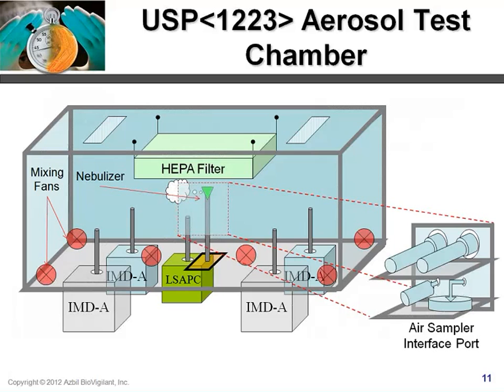So it was validated to achieve ISO 4 particulate levels, which is extremely low. Most clean rooms in the pharmaceutical and life science industries are ISO 5. So it was shown that this chamber could achieve ISO 4 particulate levels and grade A microbial conditions, so less than or equal to 1 microbe or 1 CFU per cubic meter.